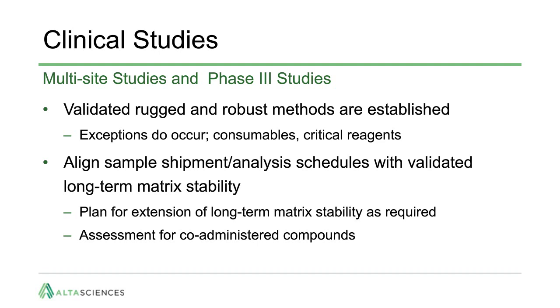For studies with a long duration and multi-site studies, sample shipment and analysis schedules should be considered in terms of the validated long-term matrix stability. Extending the stability as the program progresses to reduce risk is recommended and not leave this assessment for study end. As programs expand with different types of clinical studies, the methods and validations need to be evaluated for suitability. As an example, the impact of co-administered compounds.